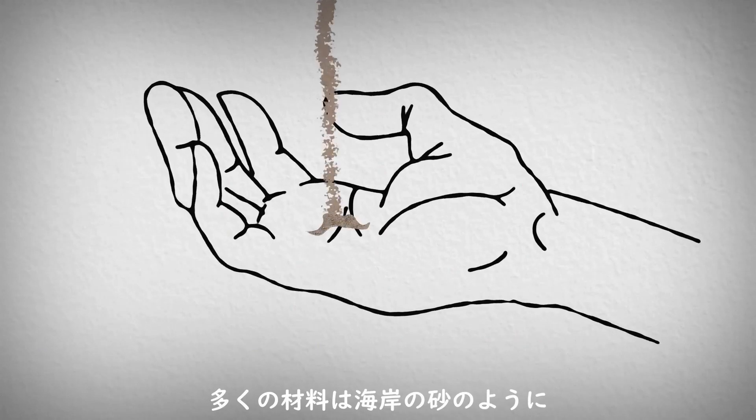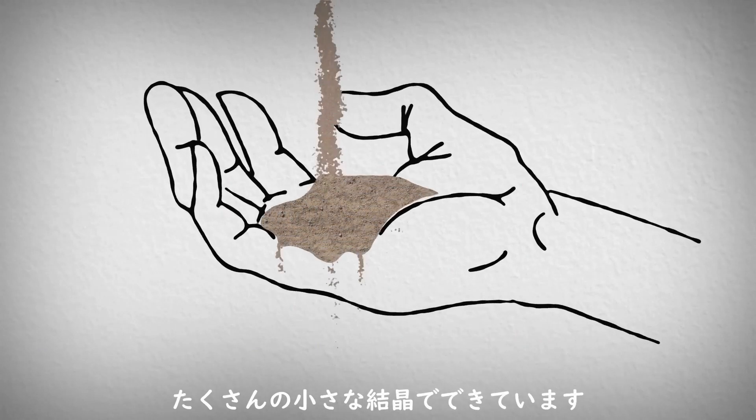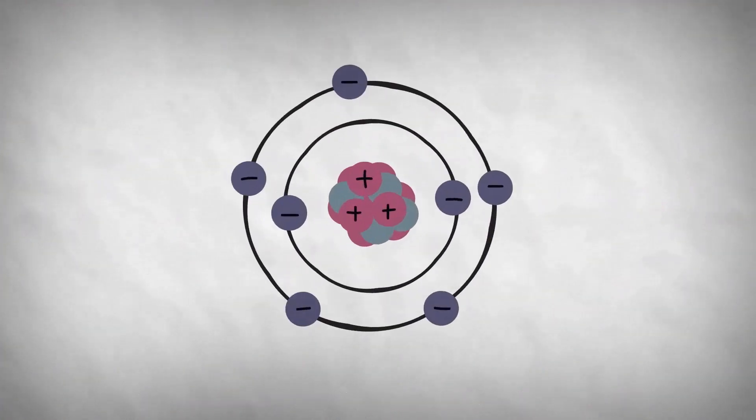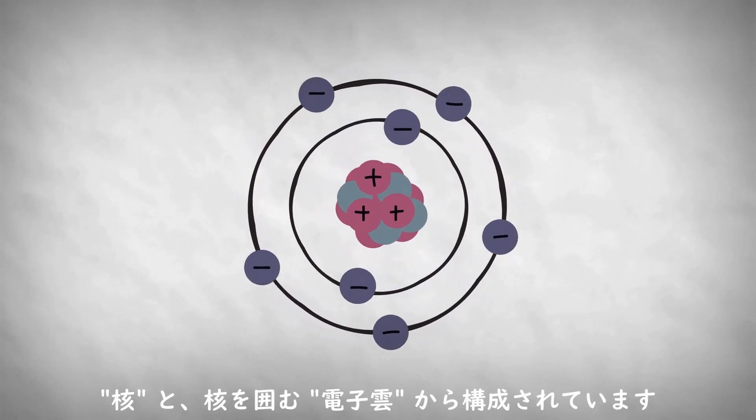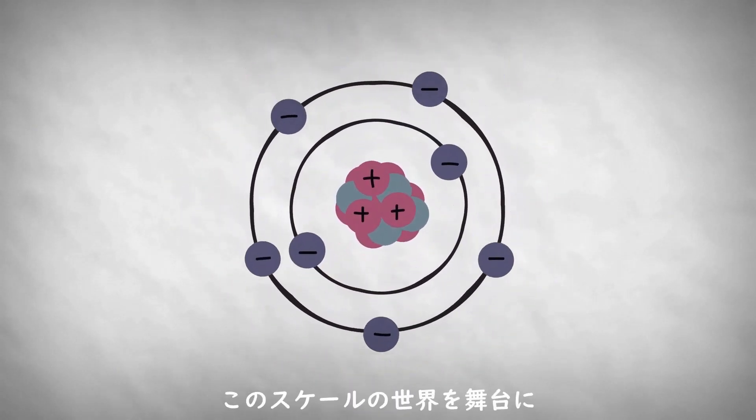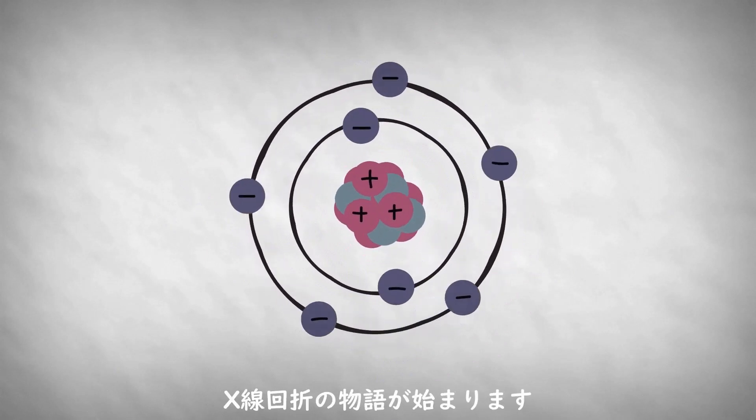Most materials are made up of many small crystals, like sand on a beach. Each of these crystals is composed of a regular arrangement of atoms, and each atom is composed of a nucleus surrounded by a cloud of electrons. It's at this scale that the story of X-ray diffraction begins.